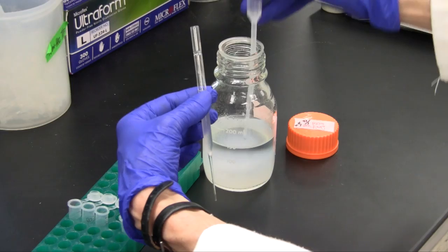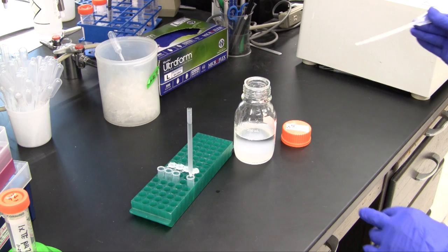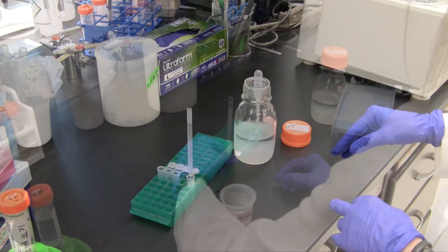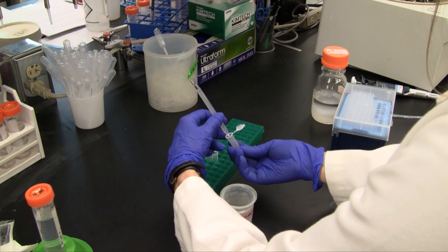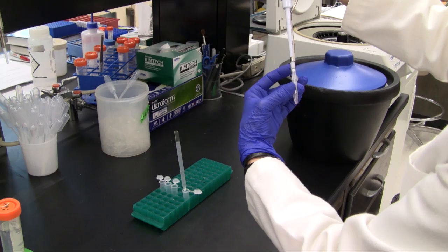The column is quickly moved up and down to begin the flow of TE, then placed into a 1.7 milliliter tube. The column is allowed to drain, and the excess TE is periodically removed from the tube. Additional biogel is added to the column until the gel height is about 3 millimeters above the pipette constriction. The nick translation reaction mixture is carefully added to the top of the matrix with a pipette and covered to protect from light.